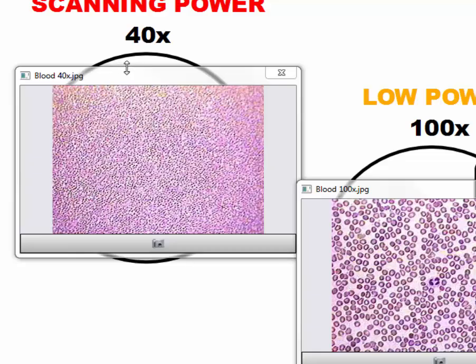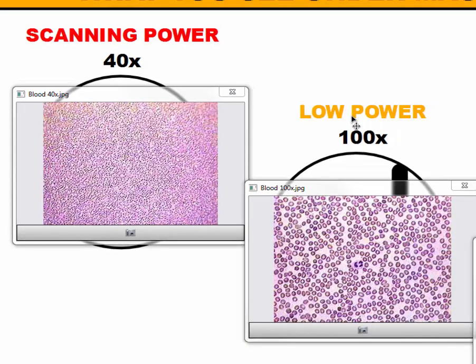But as we switch our objective lenses to a higher power such as low power to 100x, this blows up the image 100 times its regular size. So as a result we zoom in on the image and it gets bigger. And because we can see bigger versions of the image we get to see a little bit more detail but less of what's in our field of view.